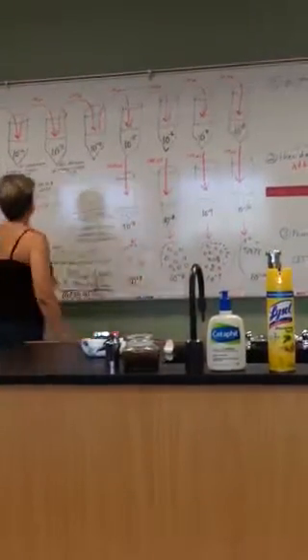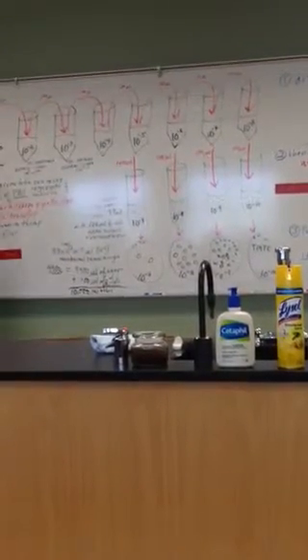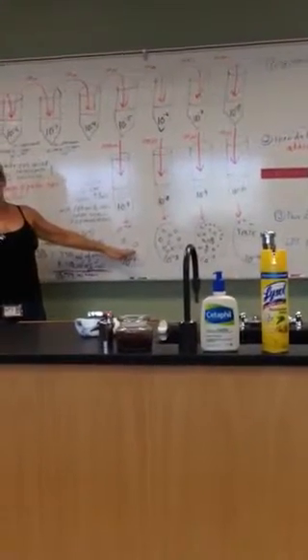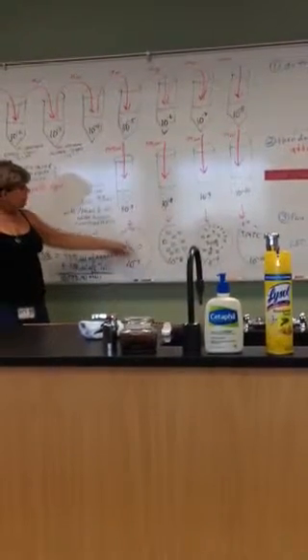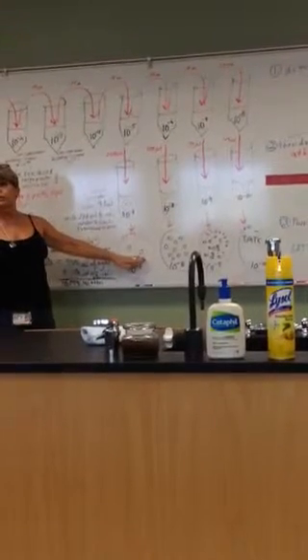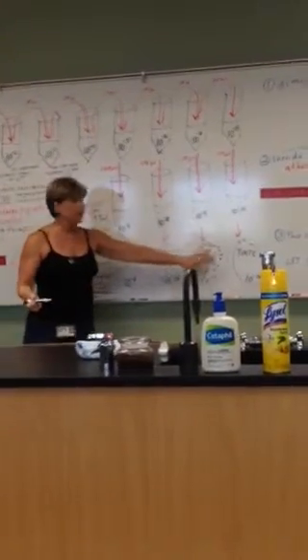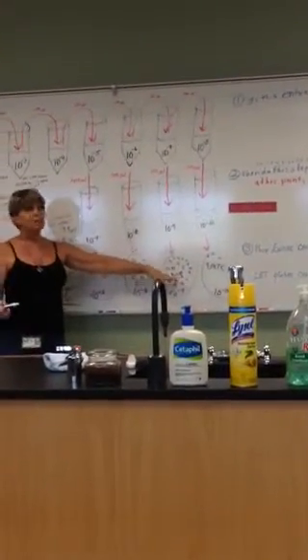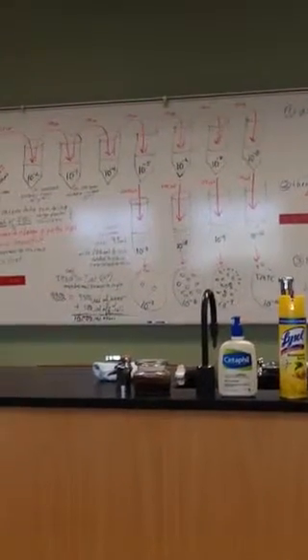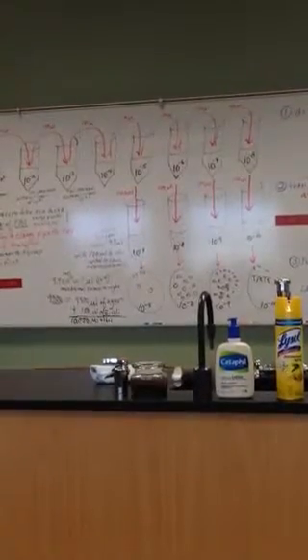Now in theory, where there is a phage in here, and it ends up infecting your bacteria and creating a plaque here, each plaque represents where there was one plaque forming unit, or one phage, right? So now, if I know how many plaques I have, I can multiply back to get a good estimate of how many phages I started with in my initial solution, okay?